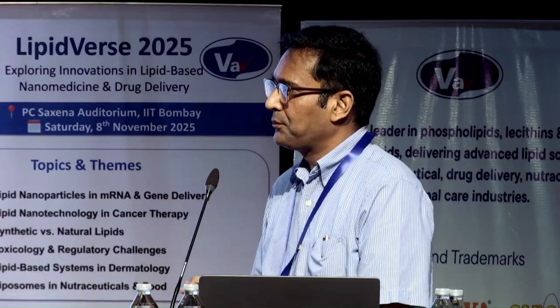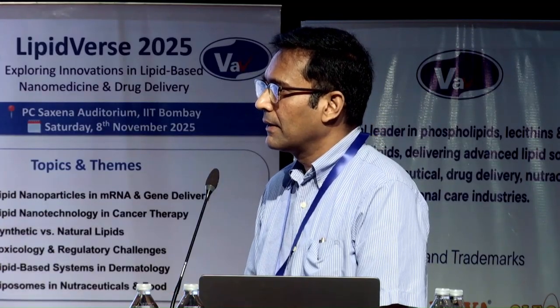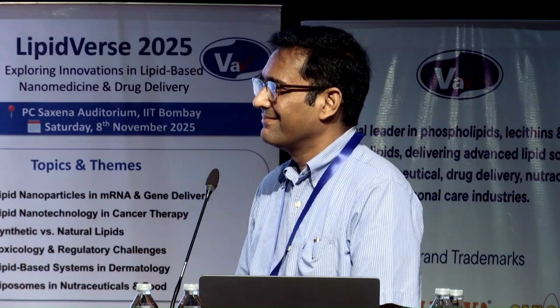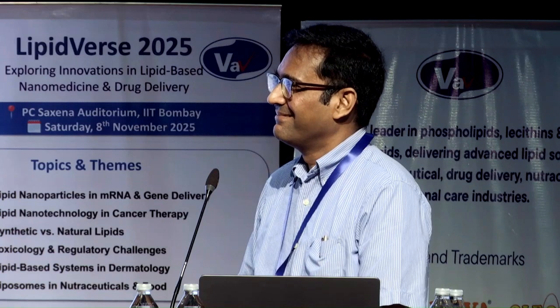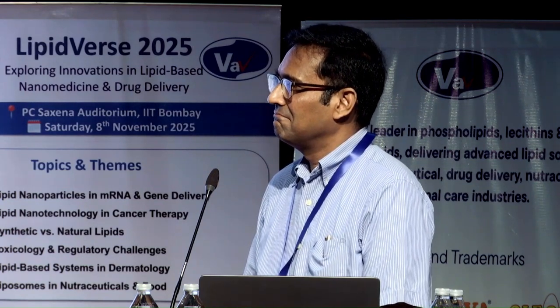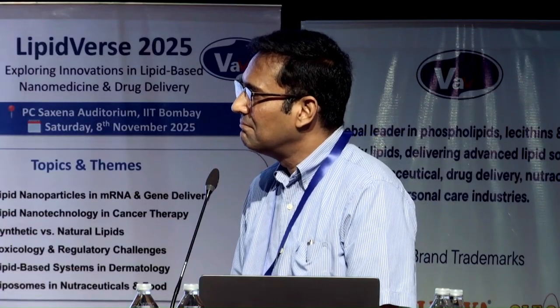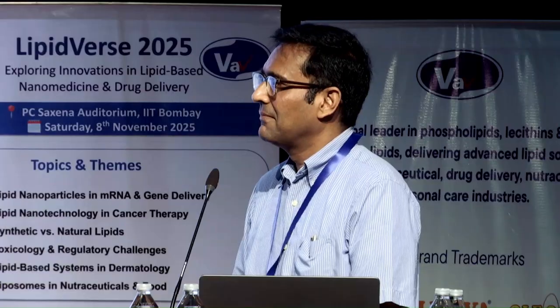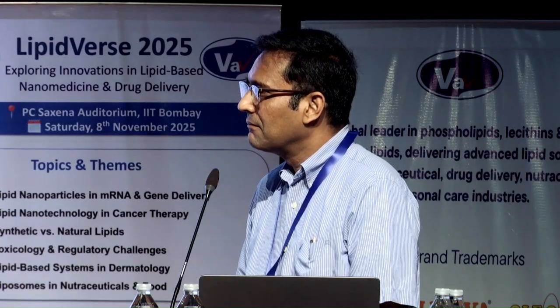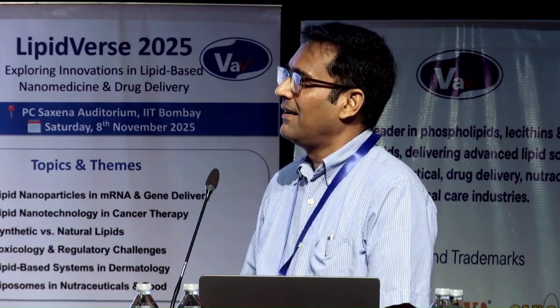I understand. Why I'm trying to pitch in this is, let aside mRNA vaccines. That is a new kid on the block and people can afford it, back in the US, here also. The regular traditional vaccines, which are still made by homogenizers, have a stability issue on the long term. But the companies or industries are not willing to use microfluidics because it is very expensive, and right now the scalability is not there.